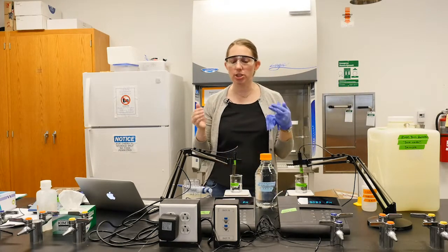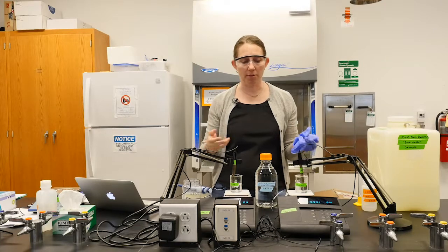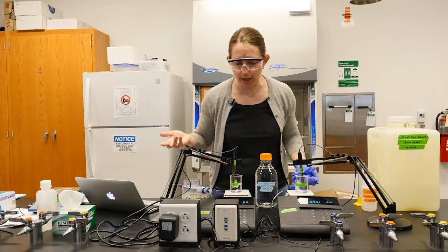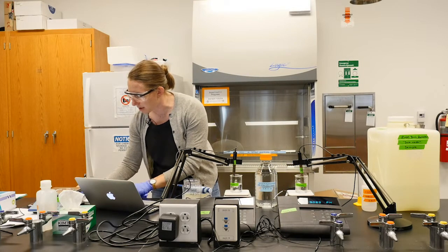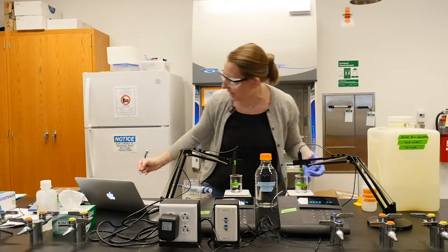And with the titrations, you know you're getting close to the end when you get to a pH of about 3. So we can check back in on that pH throughout the experiments to see how close we are to done. So I'll just write that down on the side just for reference. It's not something we're going to calculate with, but our sample is starting out at a pH of 8.200, and our standard is starting out at a pH of 9.089.